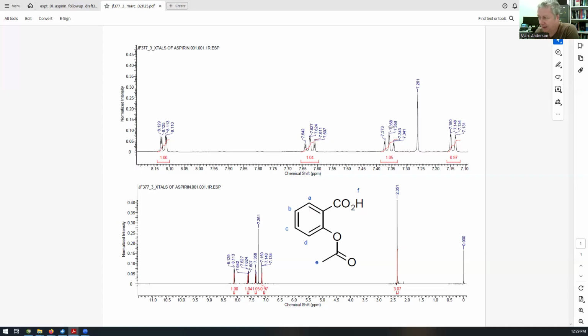That's cool. But the actual arrangement depends on the chemical structure and the electronics and various things. And these are aspects that are a little hard to predict. Some NMR experts could maybe figure out where A, B, C, and D line up here. We do see 2 doublets and 2 triplets, but the NMR simulator will specifically show us which is which. And that's really cool. What else?